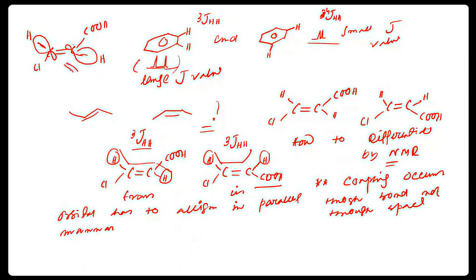Look, in this fashion, so parallelly aligned. So here we expect more coupling. Now if you ask me why parallelly aligned orbitals couple more, that is beyond our scope at this stage. But if we get time later, I will discuss why parallel coupling is most.